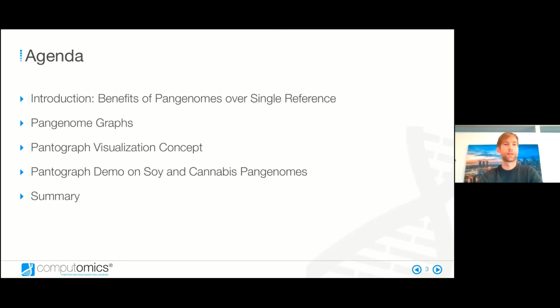I'll quickly explain pangenome graphs and then move straight on to the new visualization concept we developed. And then I'd like to show a quick demo on a soy pangenome and a quick insight into a cannabis pangenome.